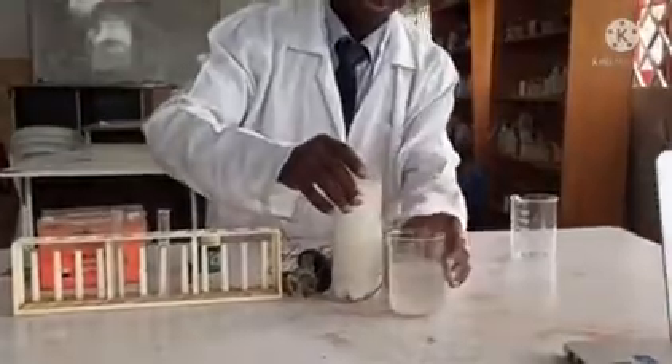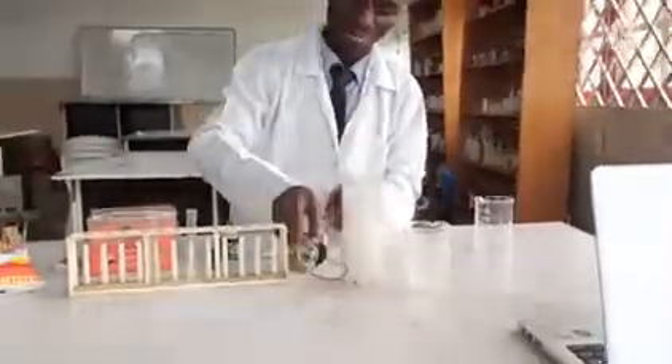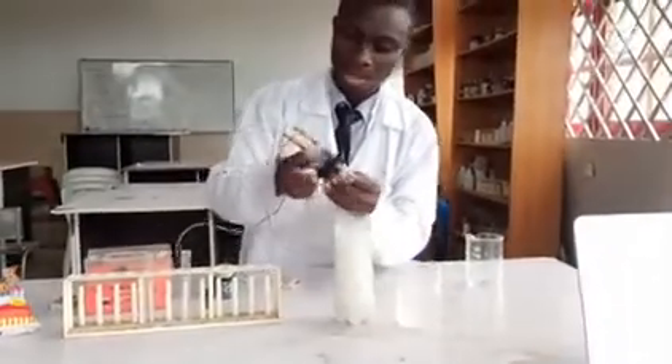I have the salt solution here — this is the brine solution. So I'm going to put in my electrodes.